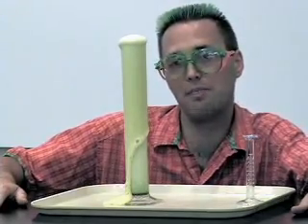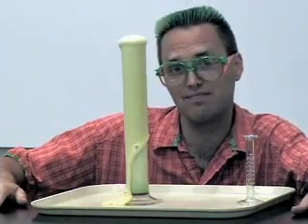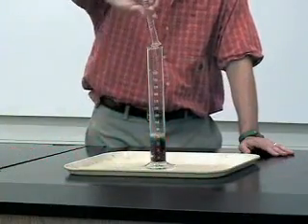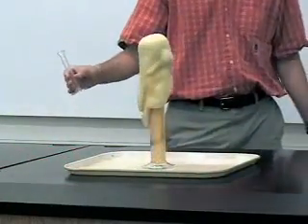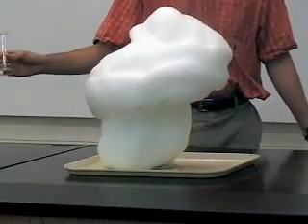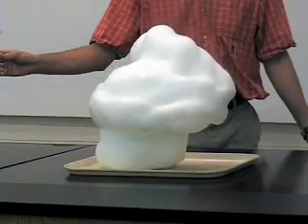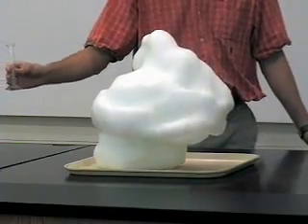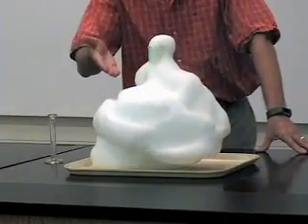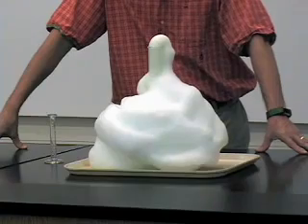So we're going to clean this up, and let's try it with 30% hydrogen peroxide. 30% hydrogen peroxide is much more concentrated, so it shall happen faster. There it is. Nice and fast. Look at how fast it's happening. That's because chemistry happens faster when there are more molecules present to collide with each other to cause the chemistry to happen. And when this reaction happens, it causes bubbles, so we get lots of bubbles when it happens fast. So 30%, it happens really fast.